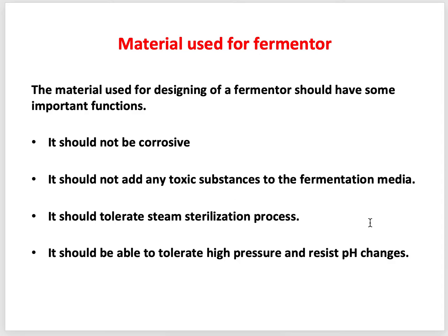Okay, and there are several methods for sterilizing. For example, which one is the most common sterilization process that we use in our laboratory? Autoclaving, right? But we can autoclave smaller things. The fermenter itself is very big, so we cannot just sterilize by autoclaving. Okay, so for the industry, steam sterilization is the most frequently used and famous process. So that's why it's essential that the material we use to build our fermenter will withstand the heat of the steam.